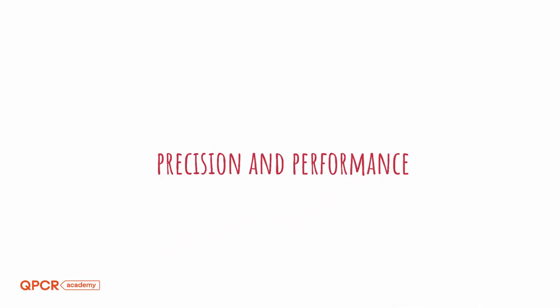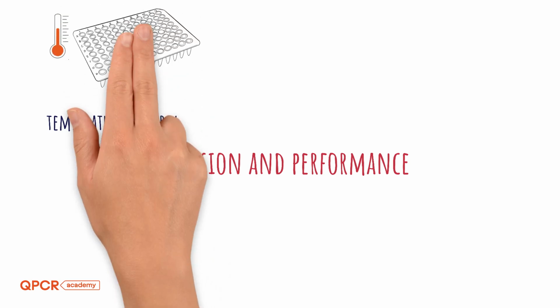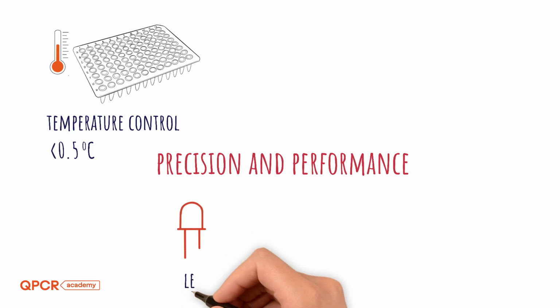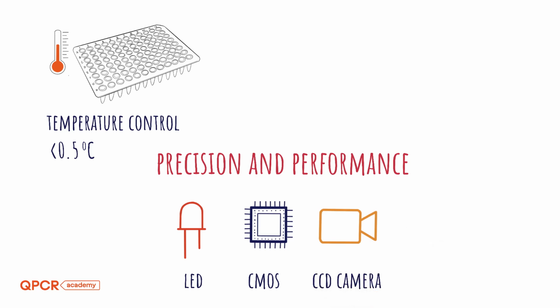Now, precision and performance. Temperature control is critical. Look for systems with less than half a degree Celsius variation across the plate. Better uniformity means more reproducible results. How your system reads fluorescence matters. LED light sources are efficient and durable. CMOS detectors offer fast, modern readouts, and CCD detectors are still a solid choice for high sensitivity.